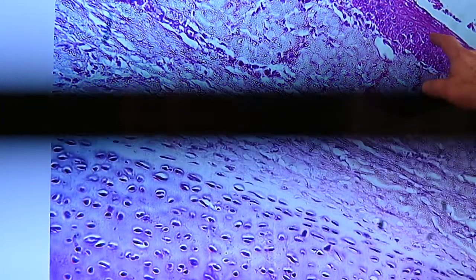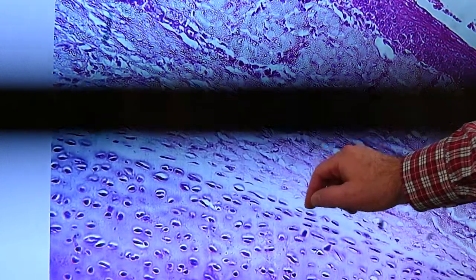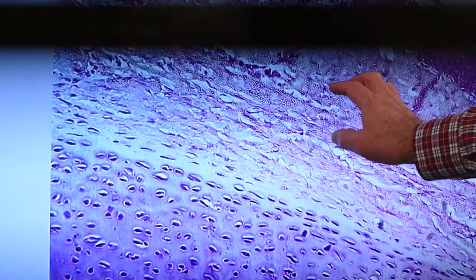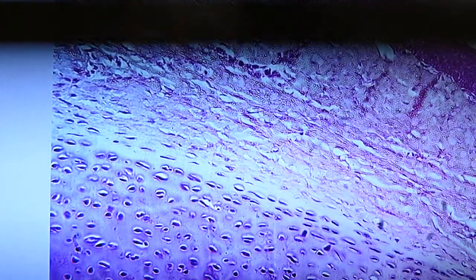Wherever we took this picture, we didn't have olfactory epithelium. We have stratified squamous epithelium. Then we have connective tissues associated with the epithelium, so that would be a lamina propria zone. Not as loose looking as what we saw in the other locations. And then we have the connective tissues associated with the cartilage. So this would be perichondrial connective tissues outside of the cartilage.